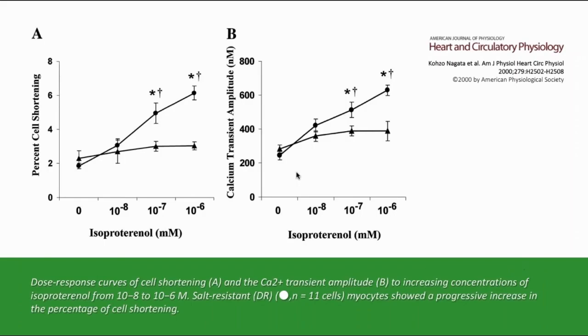The next slide is about a study that happened just before I joined the laboratory of Carl Epstein and Rongli Liao. And it shows you both the beauty of the system. This is a standard isoproterenol experiment to study the effect of beta-adrenergic stimuli on hypertensive rats. And you can see a very nice dose response curve, which is blunted in the hypertensive rats. What it also shows is that you need a really big difference before you can establish a significant difference.